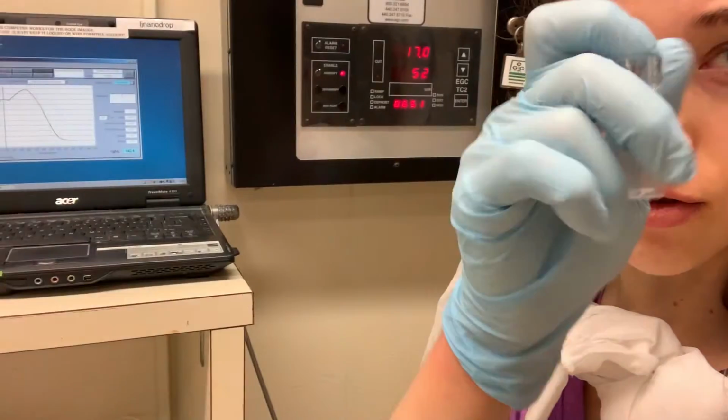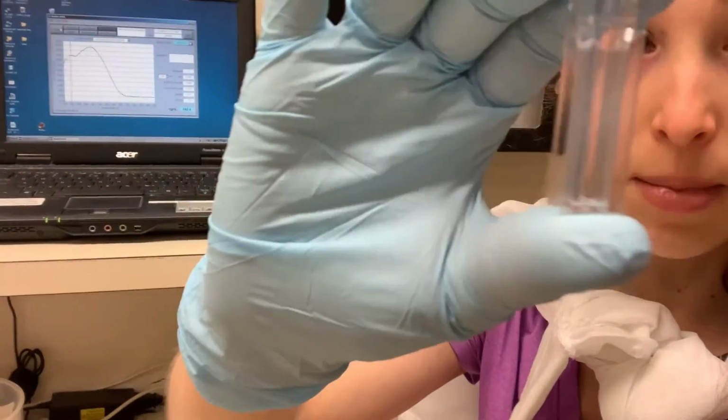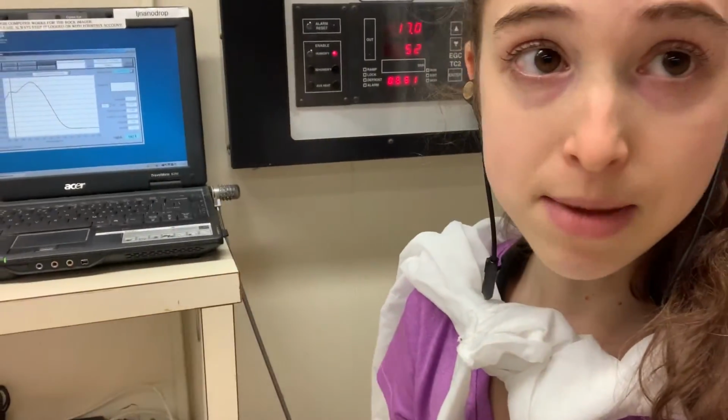So basically with a nanodrop, you have a tiny little column, so you don't have to use very much sample, but it's the same principle as with the cuvette. So you're shining light through, and then you're measuring how much light makes it through.